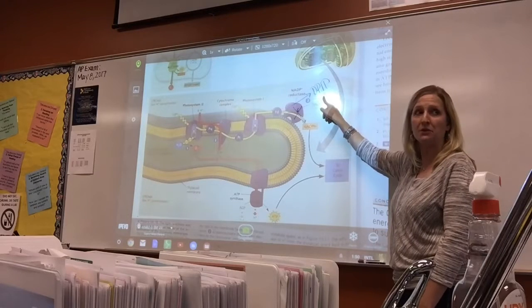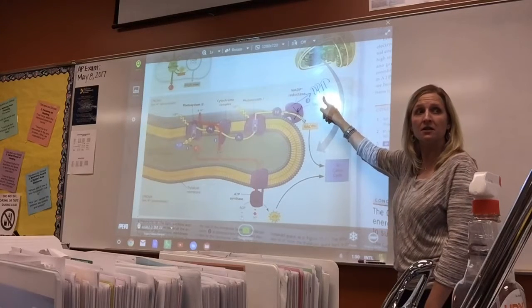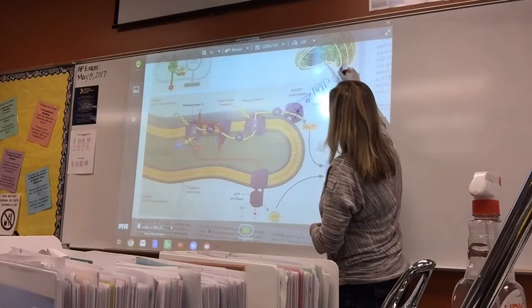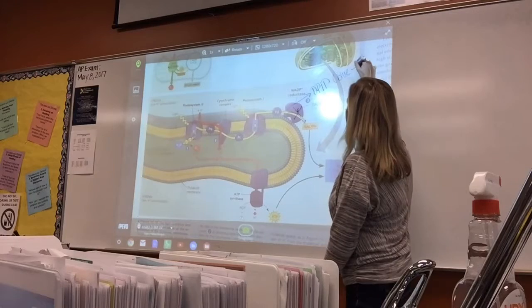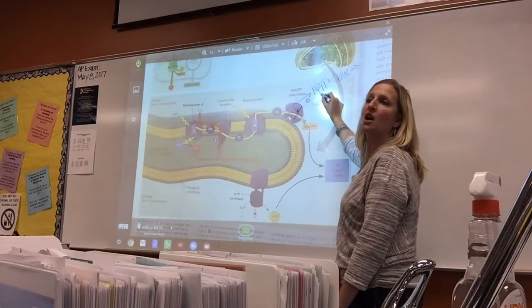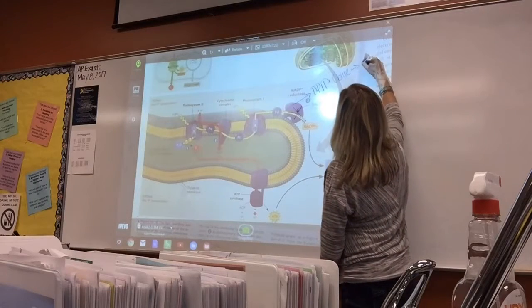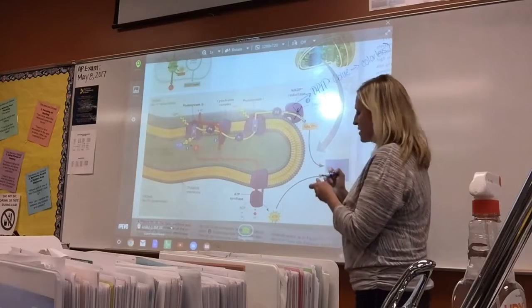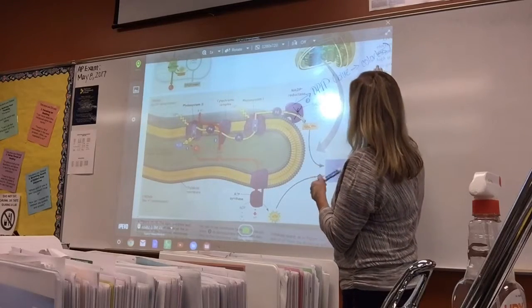How do we know it's been reduced? Connor? Does it change color? It changes color. So DPIP normally is a blue color. And as it accepts electrons, it becomes more and more colorless. So if it's completely reduced, it'll become colorless. And so it goes from blue to colorless.